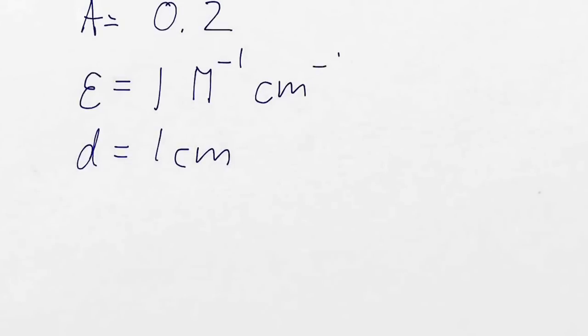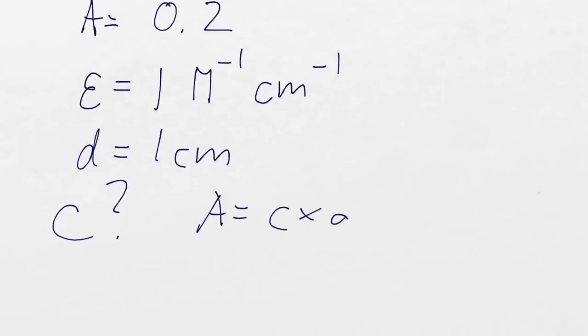Okay, so what is the concentration? So we have A equals C times D times epsilon.